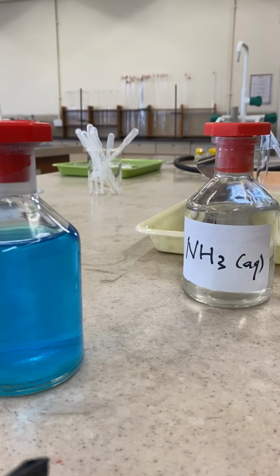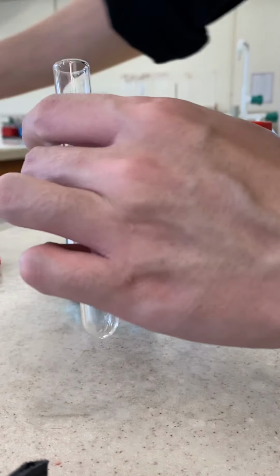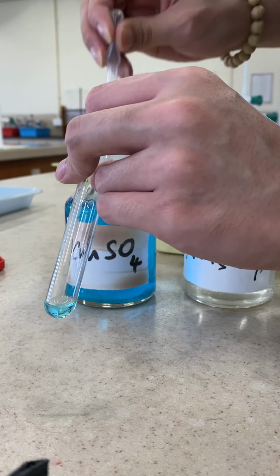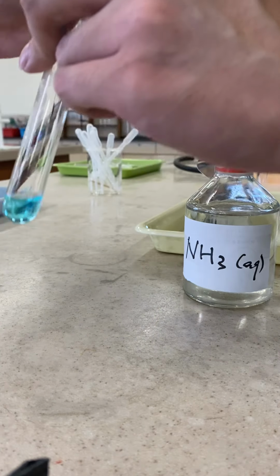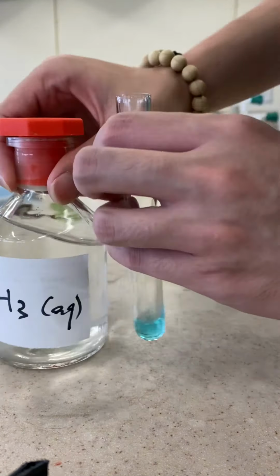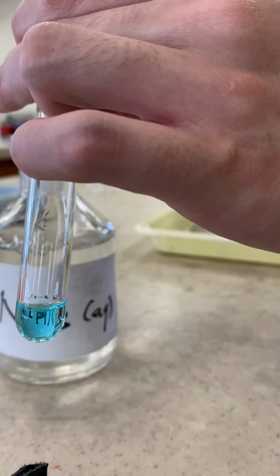What's next is that I would like to make them react with each other. So let me take our test tube and add some copper-2 sulfate solution inside. Again, you can see that blue and clear solution. You can see through it and see my fingers. Next, using a dropper, I add the ammonia by drops into this copper-2 sulfate. Let's have a look.